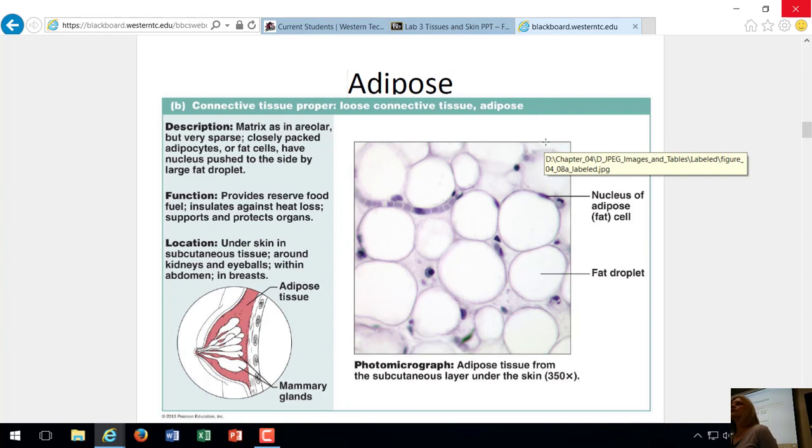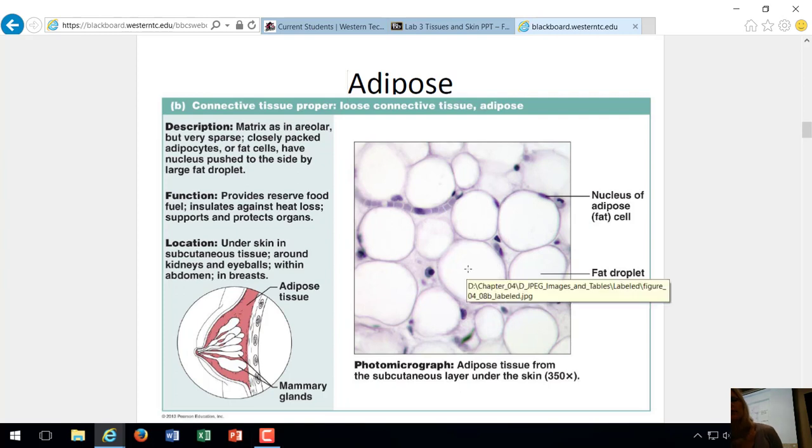Adipose tissue is fat. This is what you find underneath the skin, in the breasts, behind the eyes, around the kidneys. We find this adipose or fat tissue. The way to identify adipose tissue is you have big open looking cells because they're all filled with a big fat droplet. There's a big fat droplet in the center of these cells and the nucleus is pushed up against the edge. Another way to think of it is almost like chicken wire. There's no space between each of the holes. It's just all large open cells. That's adipose tissue.